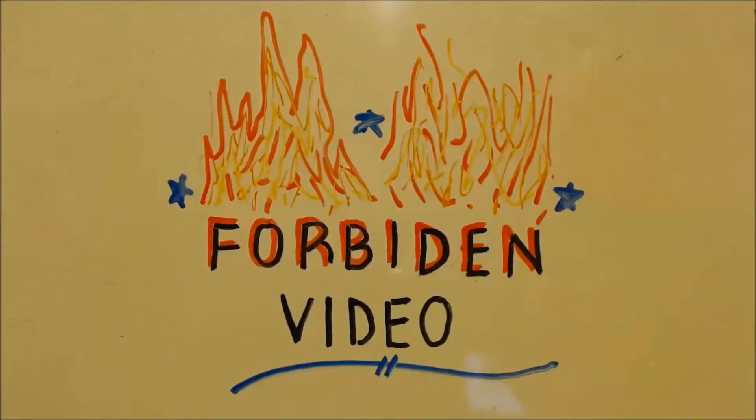Alright, this is after seven and a half hours. You can see there's a lot of stuff floating on there. A lot of stuff at the bottom. Always remember, science is great.